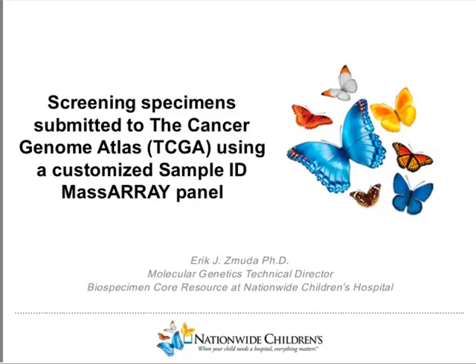So today we are considering sample identification and quality control with Agena Bioscience's MassARRAY system and how the system is being used to screen paired tumor and germline specimens submitted to the Cancer Genome Atlas.